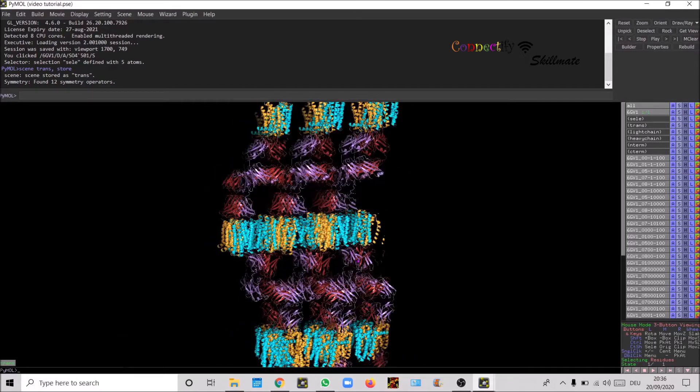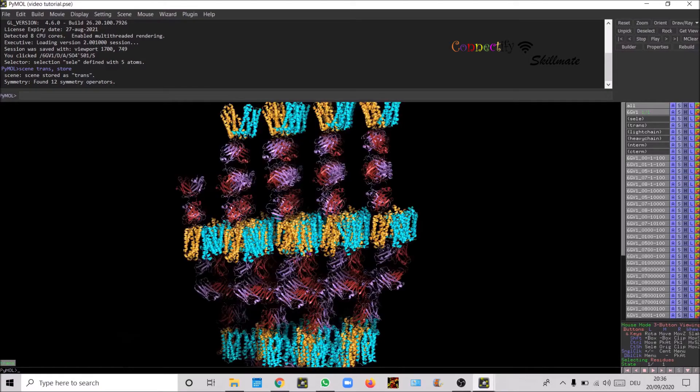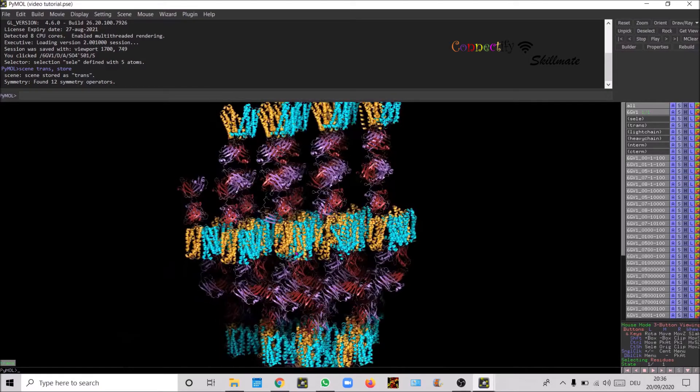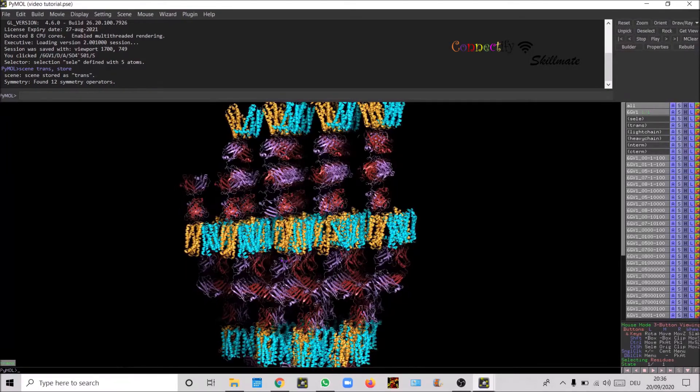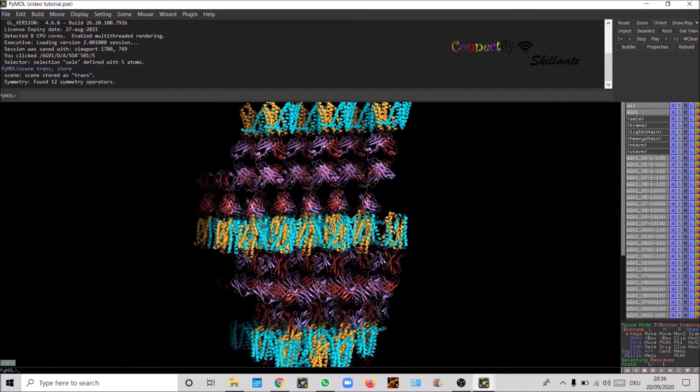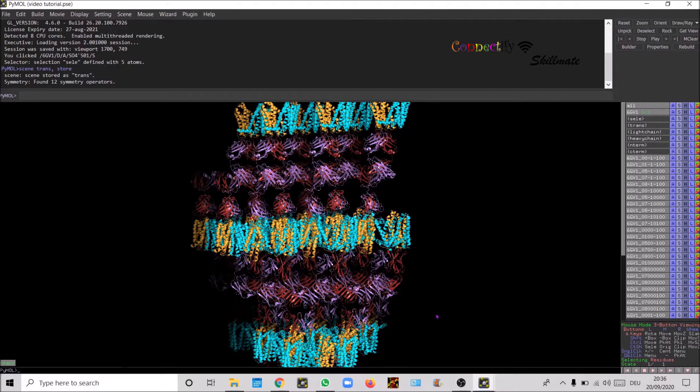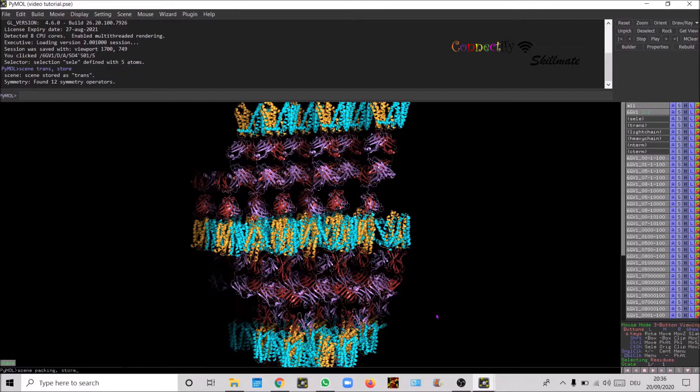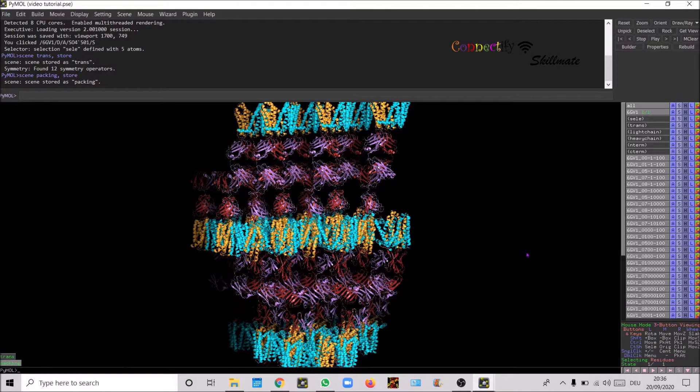Now we've got to define a view to see. Let's take this particular view for example. So let's save the scene, scene packing store. Now I've saved this view point.